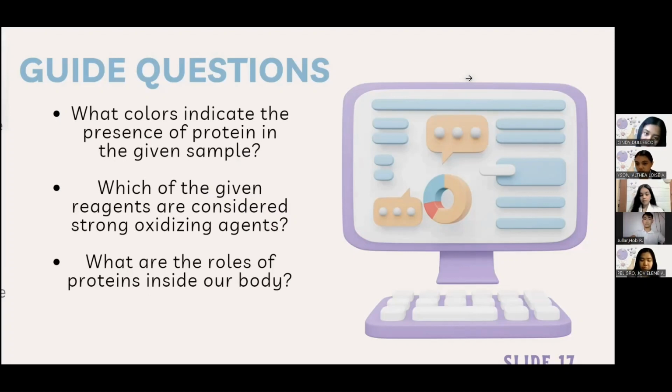From what we have researched, it is shown that ninhydrin bears the title of being a very strong oxidizing agent. The test sample's free amino acids interact with ninhydrin, oxidizing the substance and causing the coloration. Moreover, according to the experiment's findings, xanthoproteic acid and ninhydrin are powerful oxidizing agents. This is concluded because of the number of positive samples in each test, indicating that each sample tested has the presence of protein in its components. So for the third question, Mr. Jullar, please proceed.